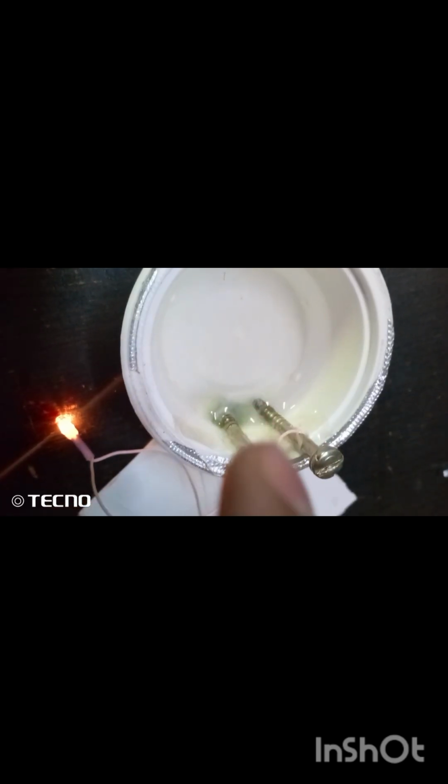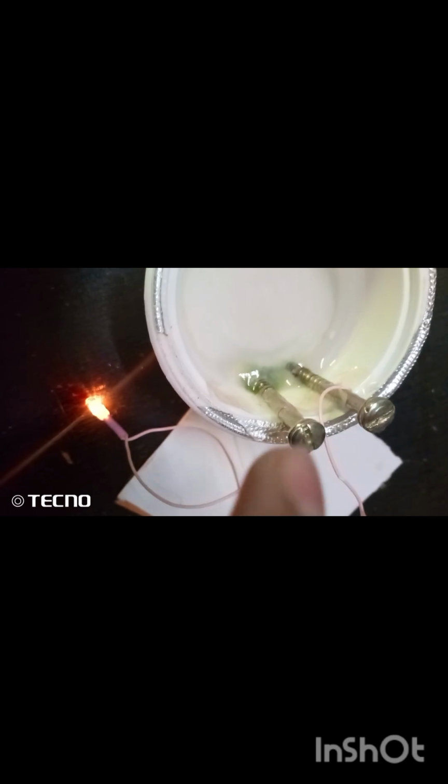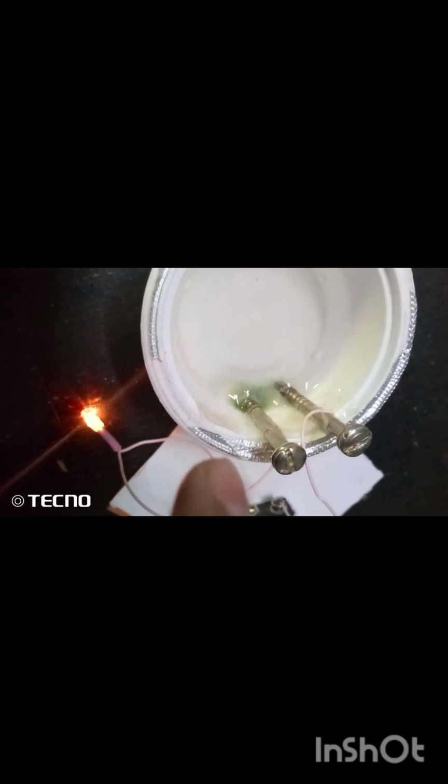I think it has some rust, and this rust deposits here, I think, as I have put it. And you can also see the changing of color around it, and I think metal gets deposited on the cathode.